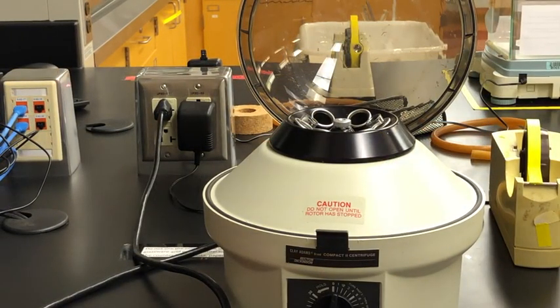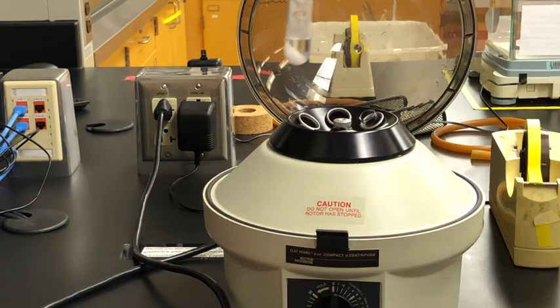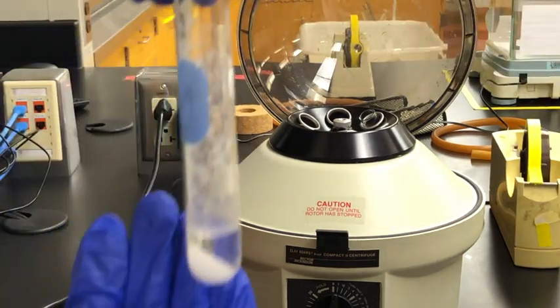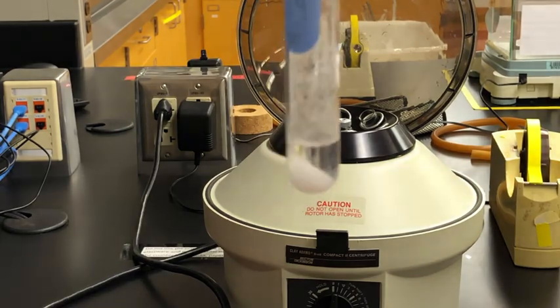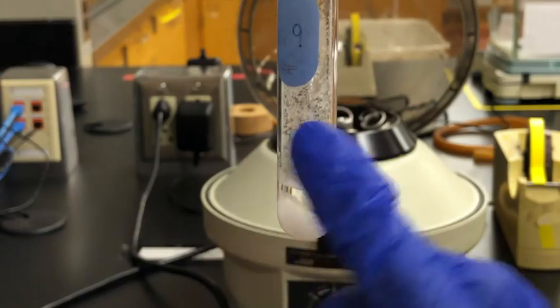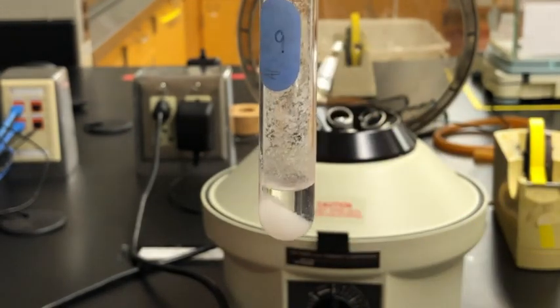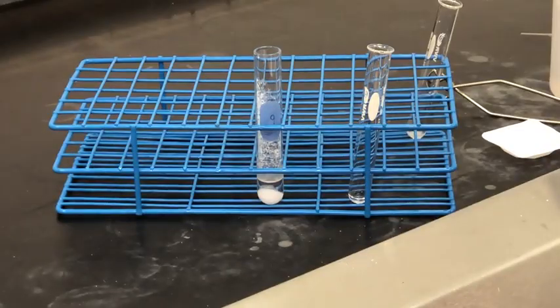Once the centrifuge is done we're going to remove our sample, and as you can see the solid has been pushed to the bottom of the tube, further separating it from the liquid. There are some crystals along the edge above, but that's okay — we're going to rinse those later.